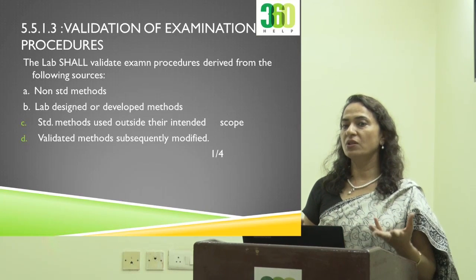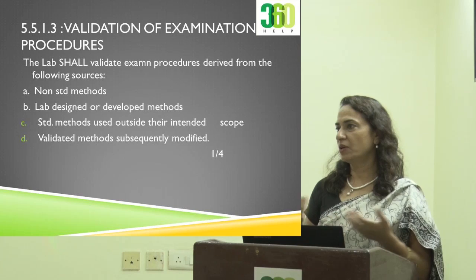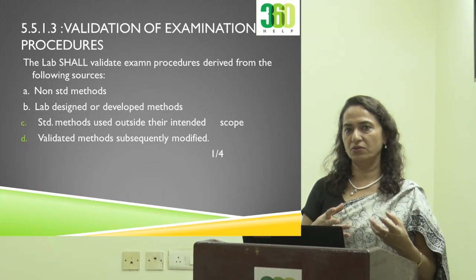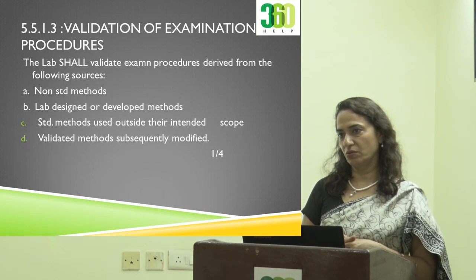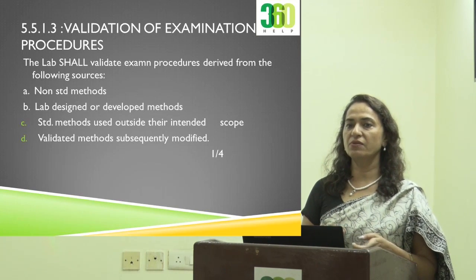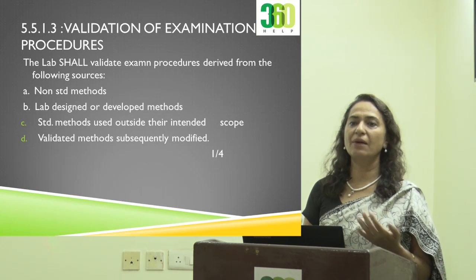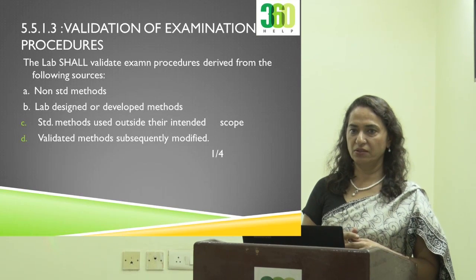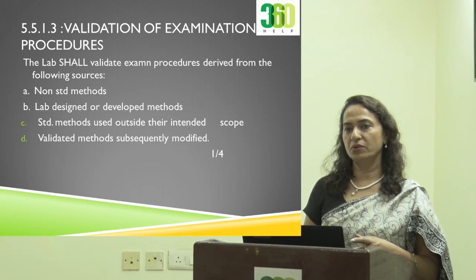Now if there is a non-standard method, there is no reference, it doesn't belong to any textbook, somebody told you this also works, would you start doing it without validation? No. Those are the processes where you need to validate. You have designed some method, it's a lab designed method, you need to validate. Standard method outside intended use.